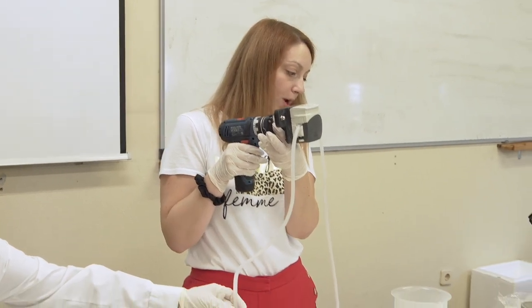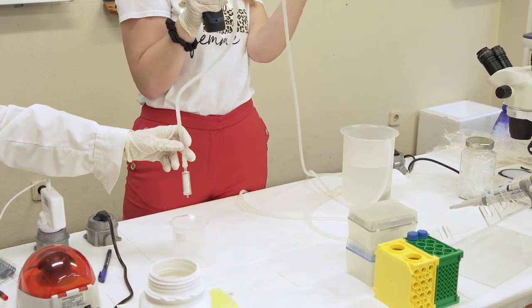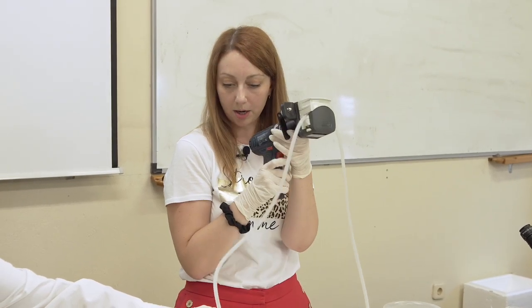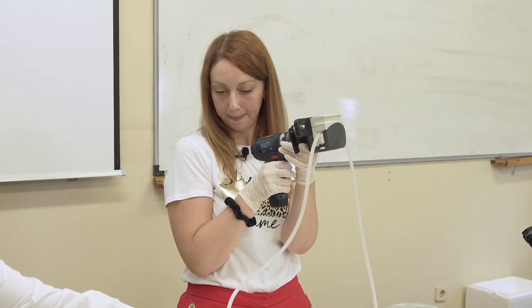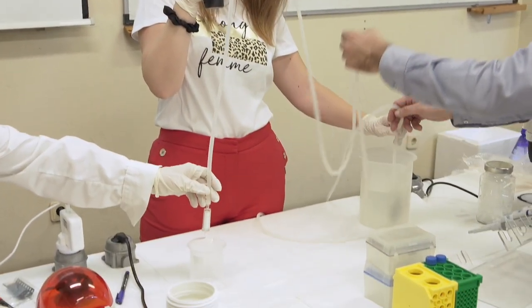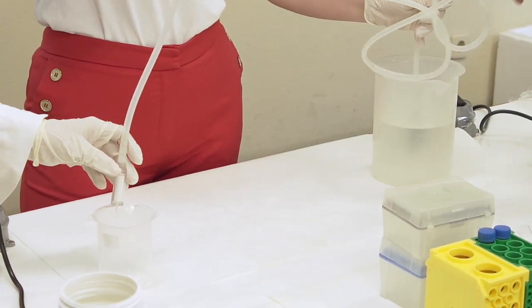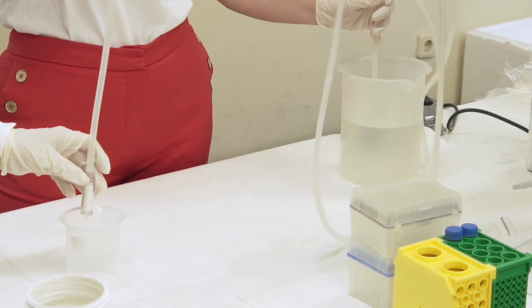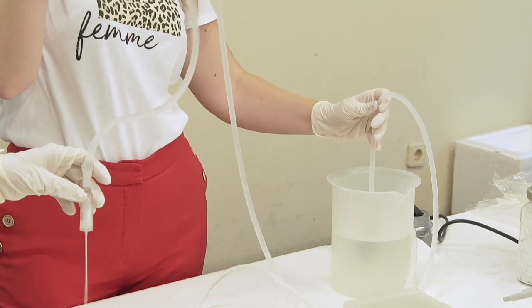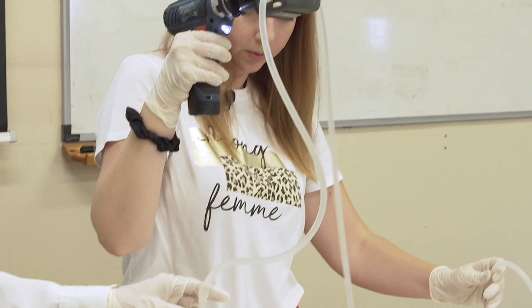We have to check that the water goes in the right direction. If it is not right, there is a button that changes the flow. So I will do it. Normally it's in the water. Yeah, that is very simple.